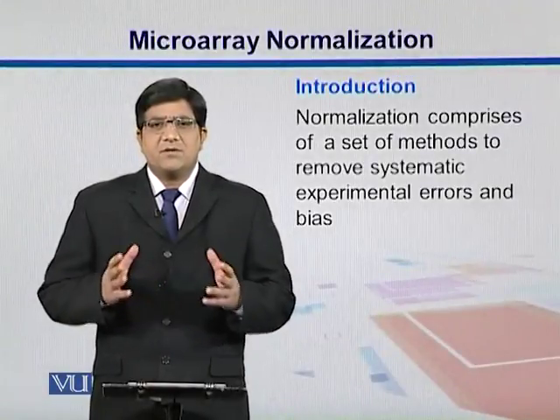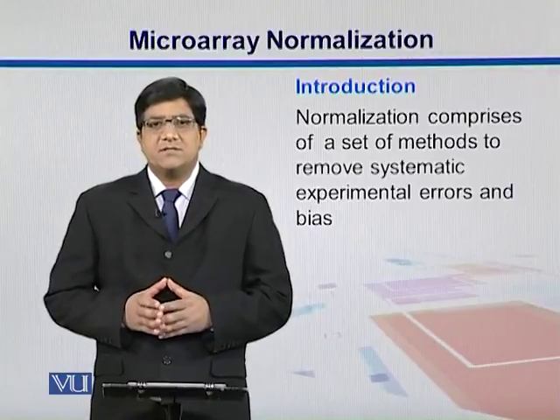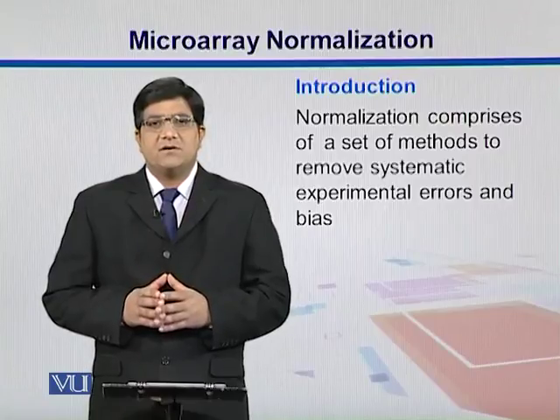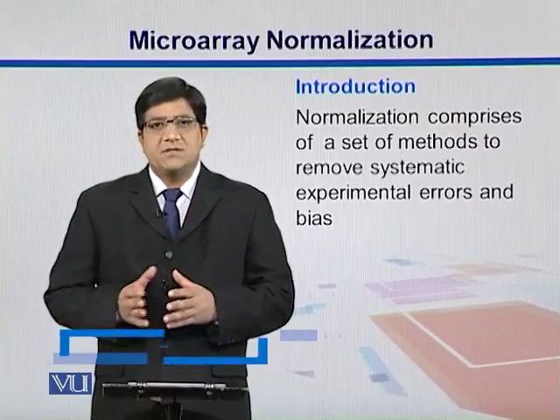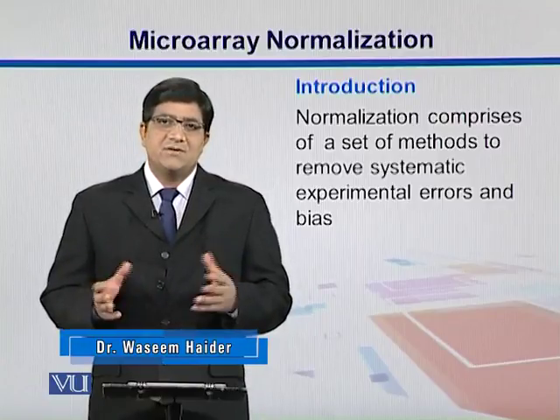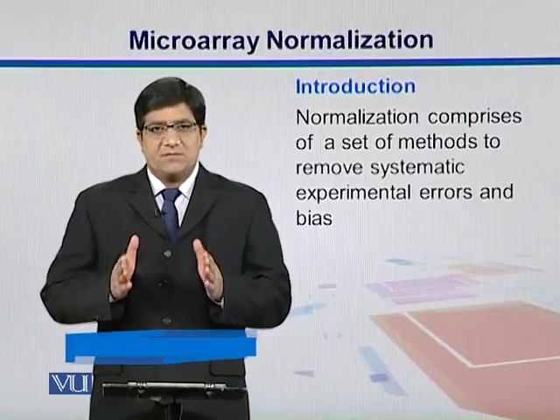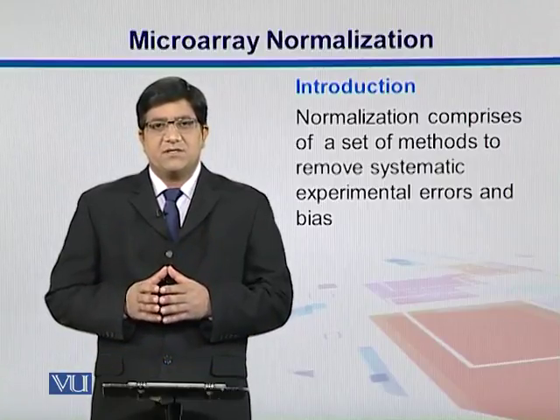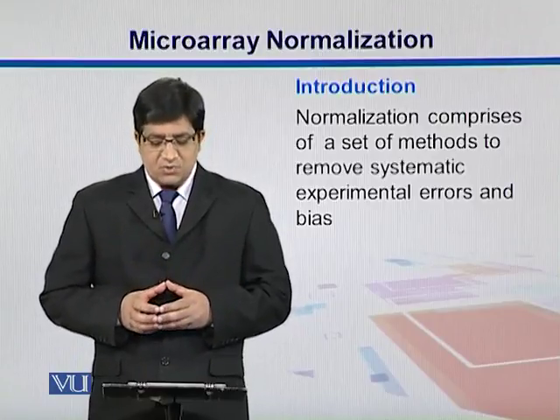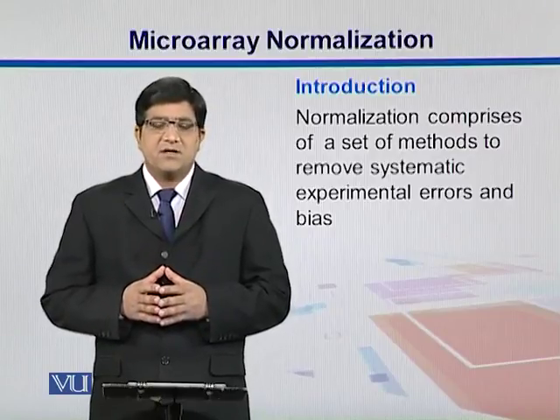Normalization is an important step as far as any experiment is concerned, but as far as microarray is concerned, it is the most important component. So we have to normalize our data for different background noises. There might be some signal coming from the slide. The slide might have scratches, or relative intensity, or attachment to some specific color dyes that might have some bias. So in order to remove those biases or those experimental errors, the process of normalization is there.